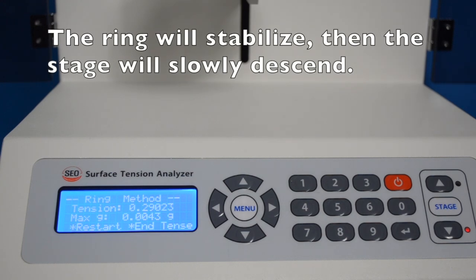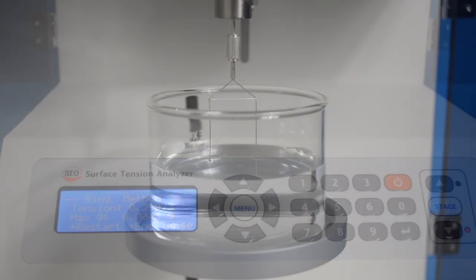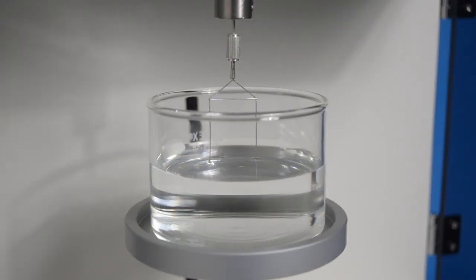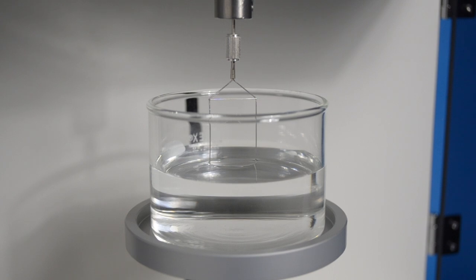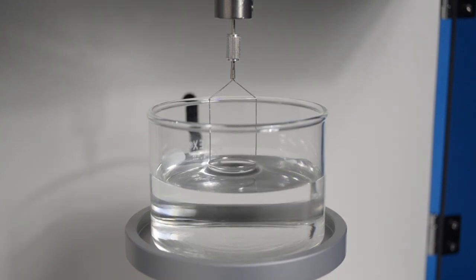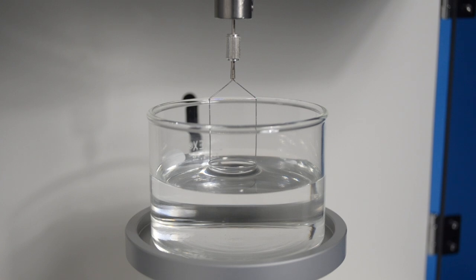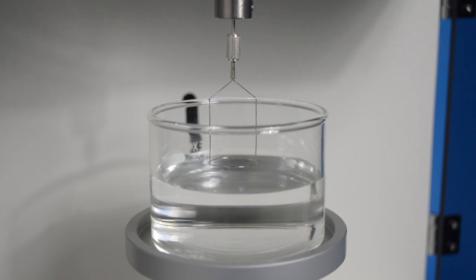And then this process starts of lowering the stage so that the ring approaches the surface. That process continues until the ring pops through the surface, which indicates the end of the test.